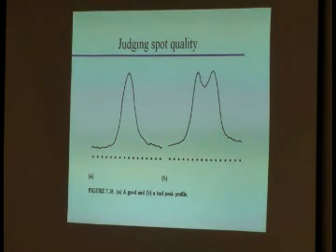If you get this, that's really a split reflection, okay? To your eye, this just looks like one bright thing. But if you look at the intensity profile, this is not okay. That's not a single spot. Another way of judging it, even if you don't get that dip, is do all the spots have about the same width? Okay? Even if I didn't have this dip, if this thing was twice as big as that one, width-wise, something is wrong. Okay? They can't both be the same type of single spot.